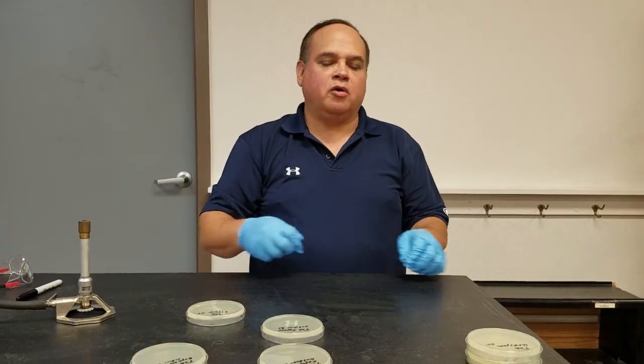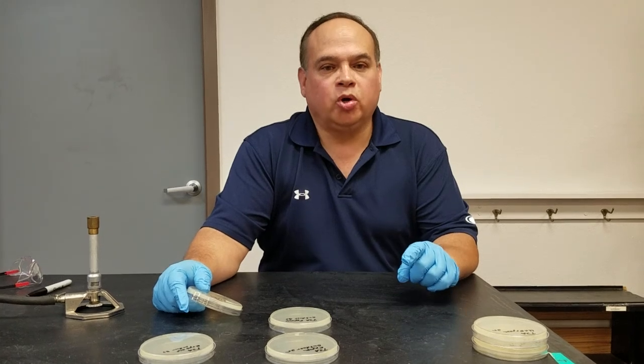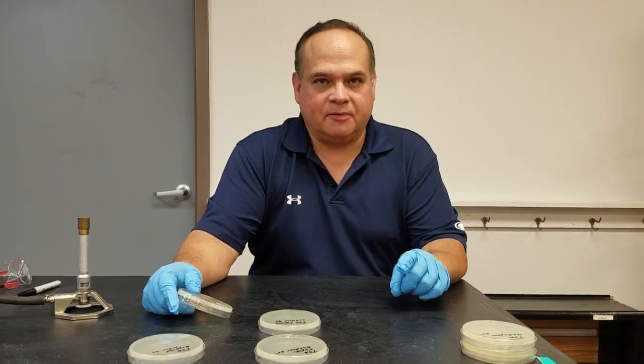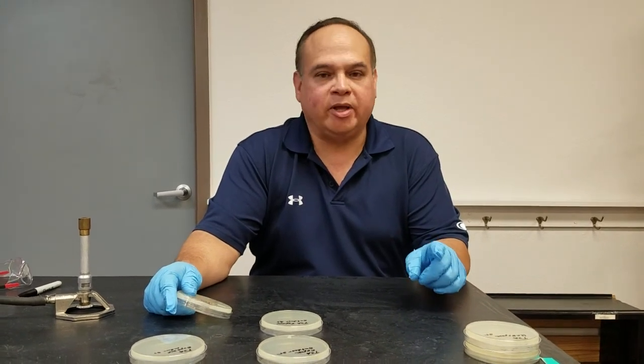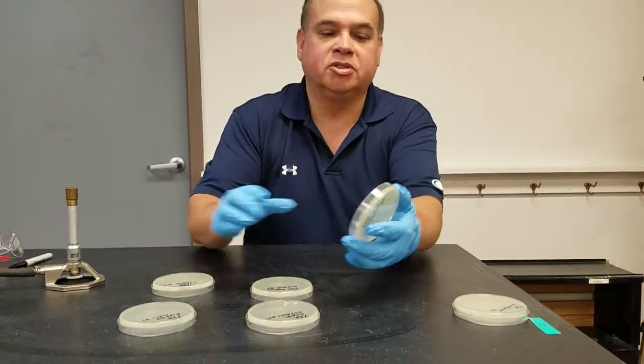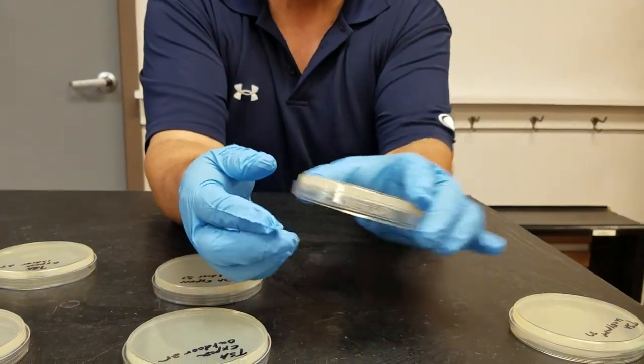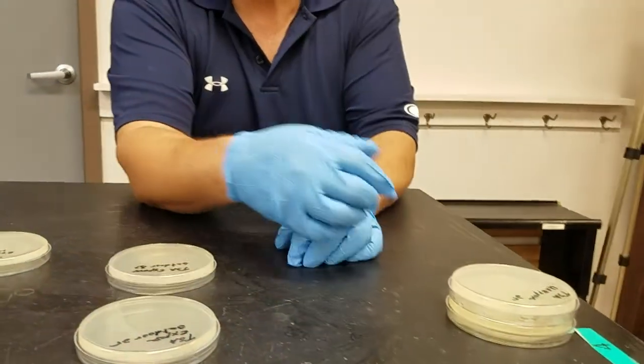For our first lab activity, we had just poured the plates — you've seen that particular video of how we pour plates aseptically. These are the plates once they've been cooled down; you can see that they've solidified. The agar has polymerized and these plates are now solid.